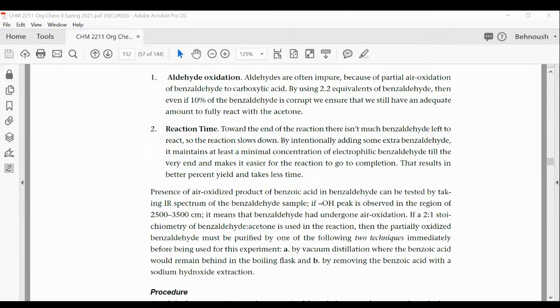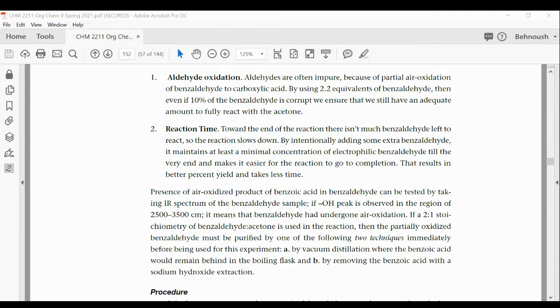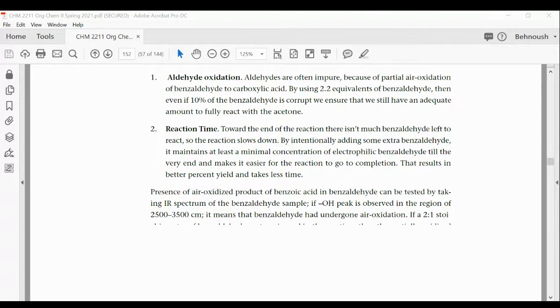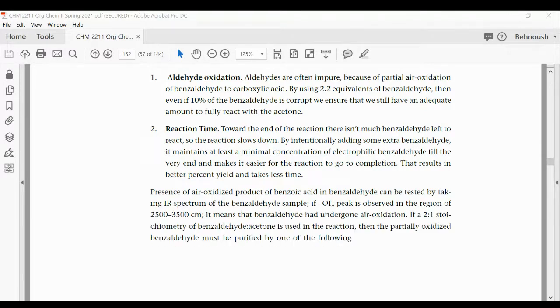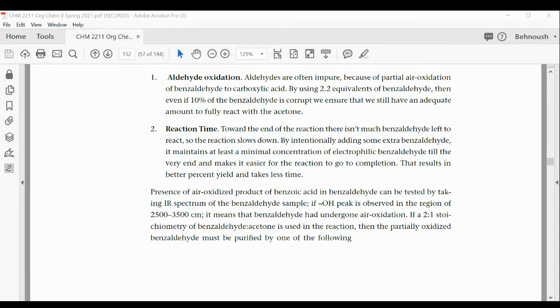A 2 degree difference is not a significant number to worry about and look for many sources of error. Or you could say in the conclusion that if the melting point is lower, that means it's impure. That could have been leftover of the reactant or other impurities, or the sample is not dry. Okay. Good question. Thank you.